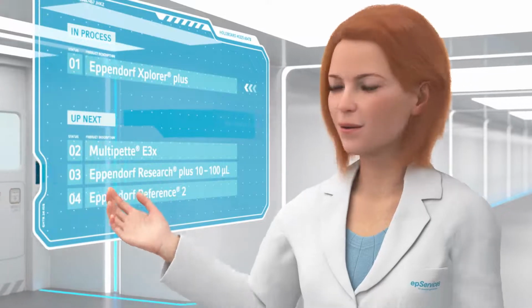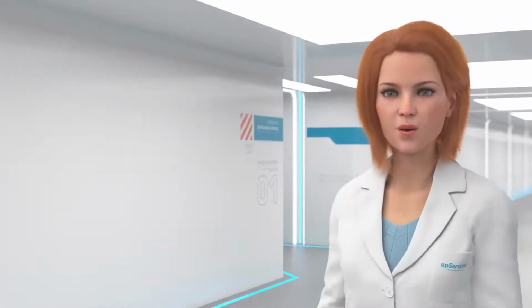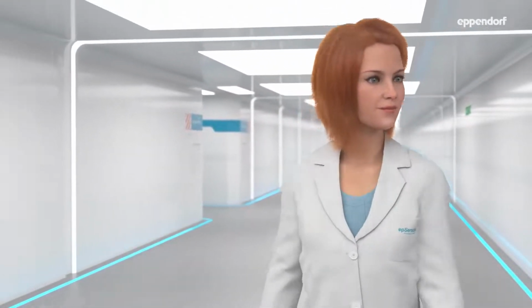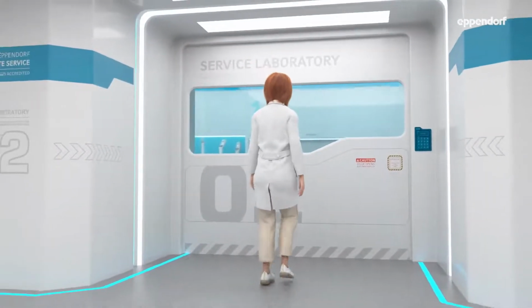I see your pipette is being serviced. Let's watch how Tom is performing the maintenance procedure. Here we are. We will now enter the environmentally controlled zone.